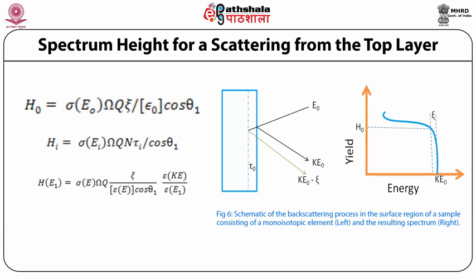The reason is that particles with slightly different energies after scattering at x undergo slightly different energy losses on their outward path.